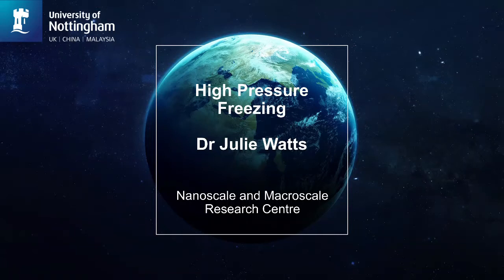Hello, my name is Julie Watts. I work at the University of Nottingham in the Nanoscale and Microscale Research Centre and I'm going to be talking to you and doing a demo on high pressure freezing.